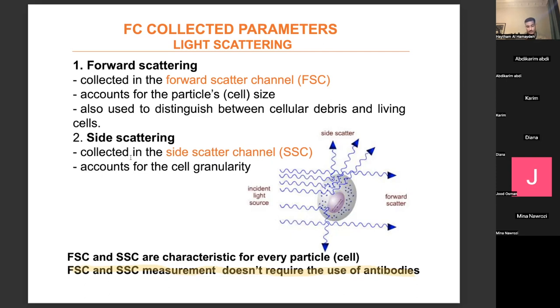Now, even though we're the same height, I'm darker, let's say because I have more granules in my skin. We also have detectors not just behind, which only measure a shadow. Behind is the forward scatter detector, but all around are detectors. I will absorb more light than Diana because I have more color. Diana will reflect more light.